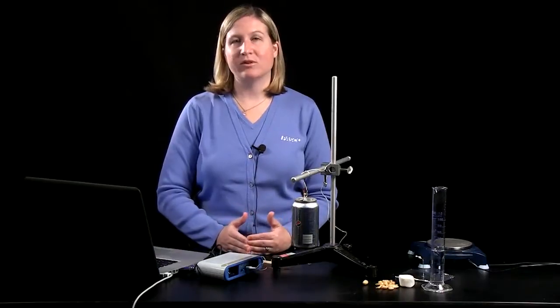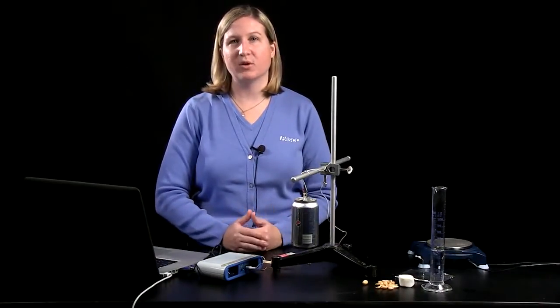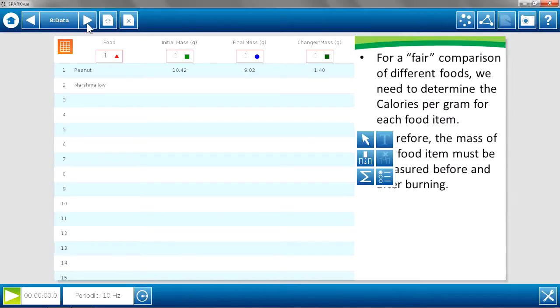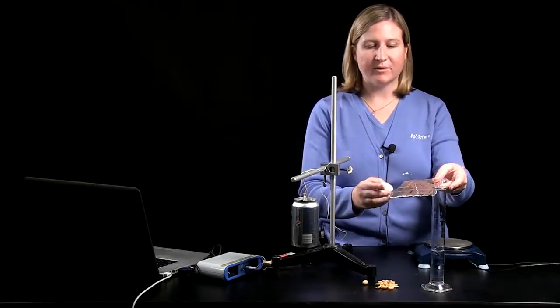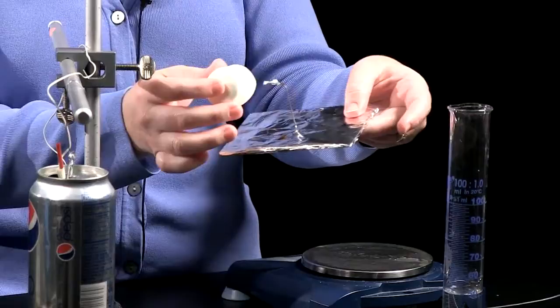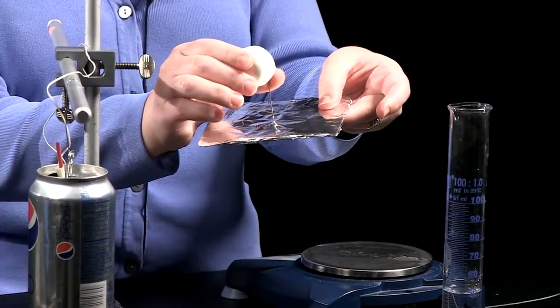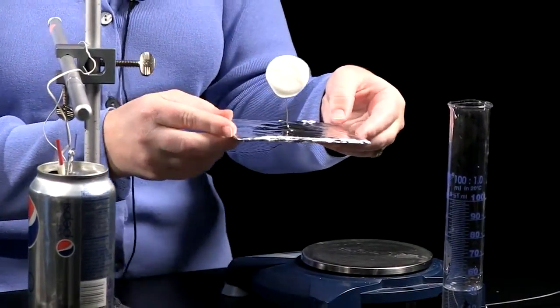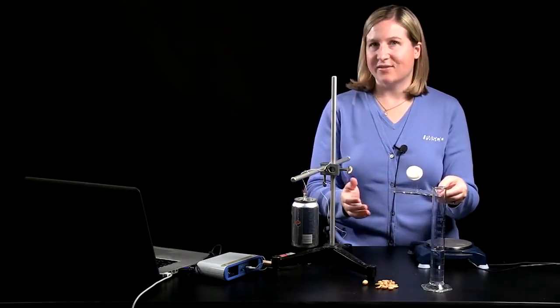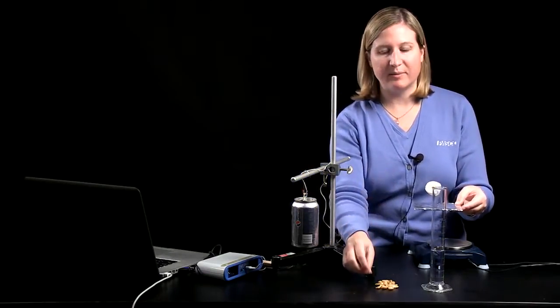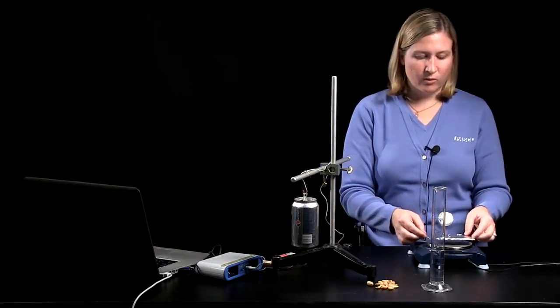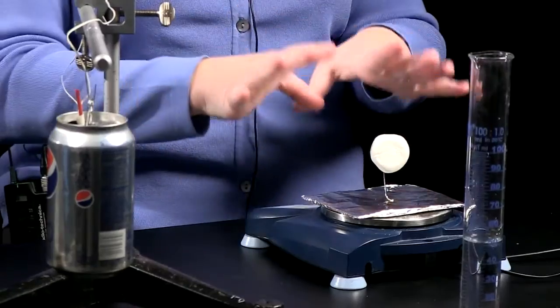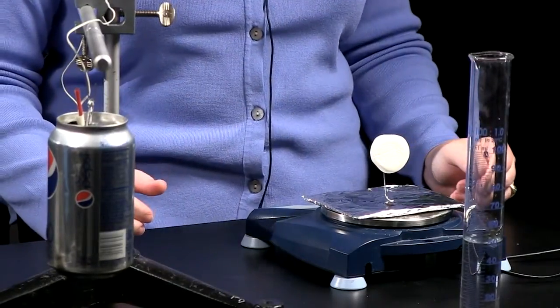So this lab will involve measuring a temperature change, but also a mass change. So it's important to get the initial mass of the food before burning it. I'm using a simple food holder made from a piece of cardboard wrapped in foil, a paper clip to be the holder. I'm going to put the marshmallow onto my food holder. For sake of the video and saving us a little bit of time, I went ahead and collected data on the peanut earlier so that we can do the comparison.